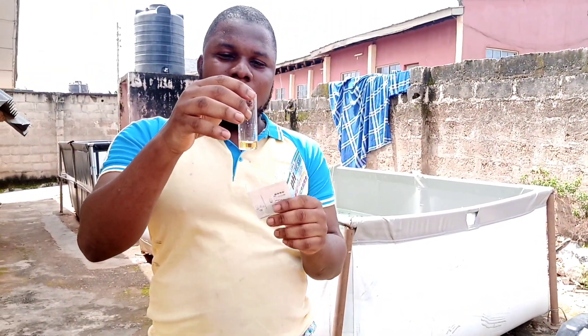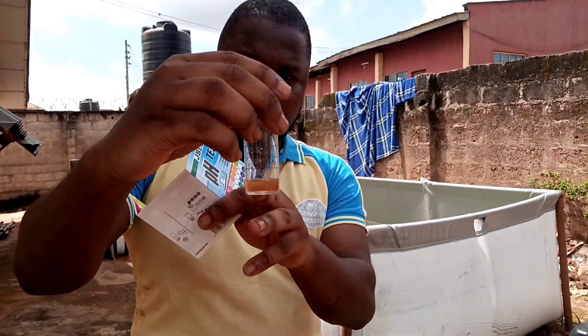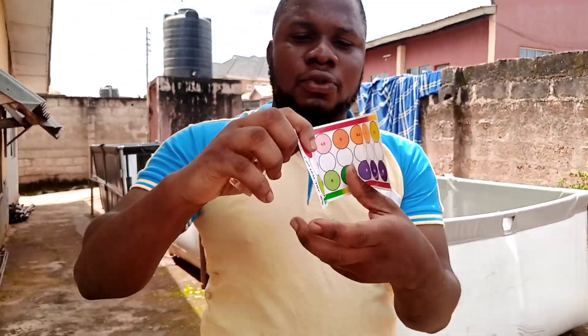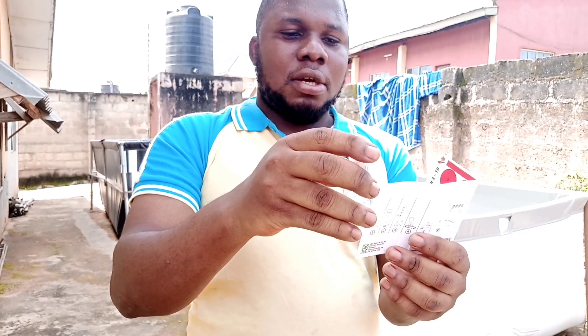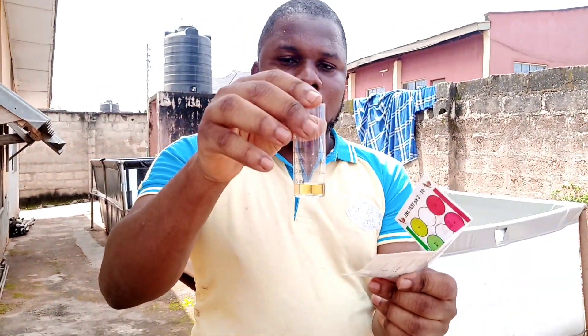Alright ladies and gentlemen, this is after 3 minutes. You can now see the 5ml sample. You can see the color. So once we see the color, we are now to check the color format against the chart. If you look at it, it resembles purely number 6.